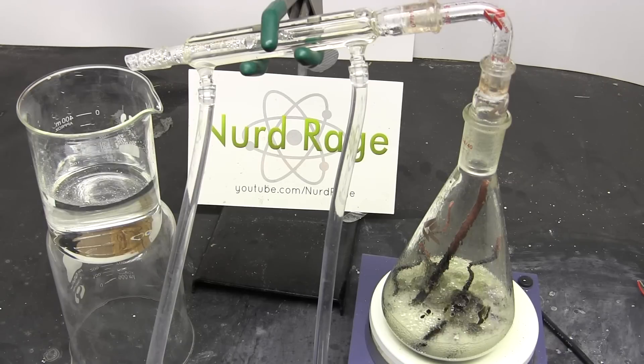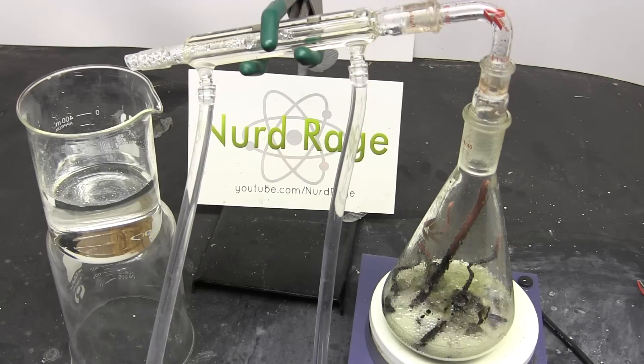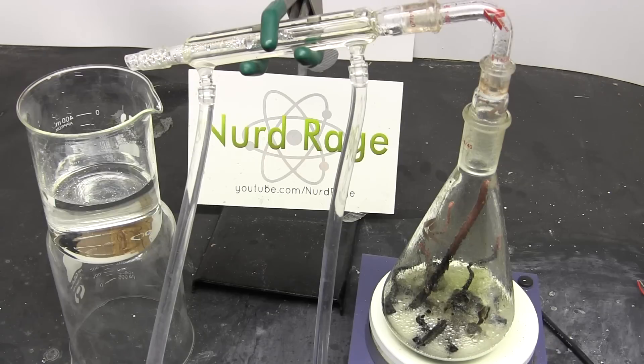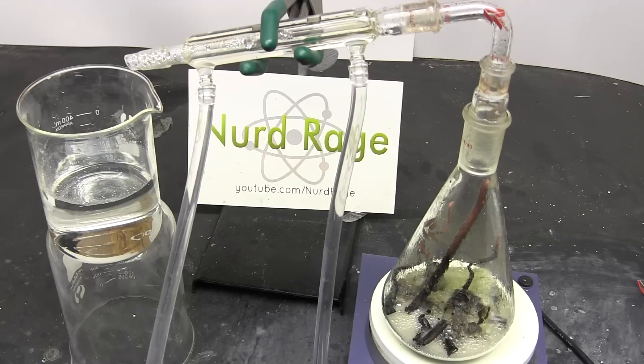Finally the residue should be this light color of iron 2 chloride and copper 1 chloride rather than the black brown color of iron 3 chloride and copper 2 chlorides. If it's not you need to let it cool, add the acid back in and boil it again until it is. You also need to make sure that there is an excess of copper metal left over. If all the copper metal reacted then there is likely still unreacted iron 3 chloride and copper 2 chlorides so you'll need to add in more copper metal when repeating the distillation.